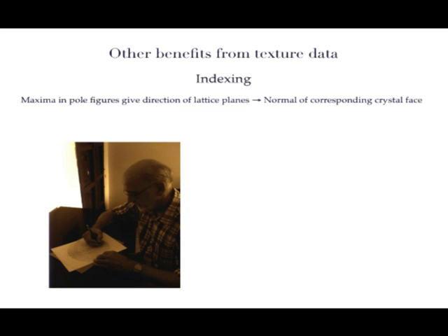And here we have the old crystallographer. He has put all the data on this Wulff net, and we get something like that. I don't know how many of you understand these pole figures. We have great circles here which belong to a zone. So there's a peak here, there's a reflection here, and there's a reflection here. That's easy on one zone, so we know they belong to the same zone.